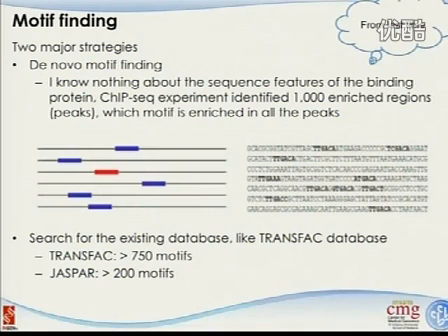For me, the second strategy makes more sense and is easier to do, and then you can design follow-up experiments on those. It involves searching the existing databases, like the TRANSFAC database. As I mentioned, almost 1,000 binding motifs for transcription factors have already been documented.